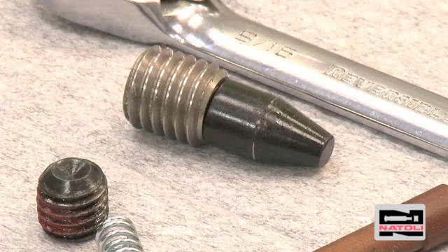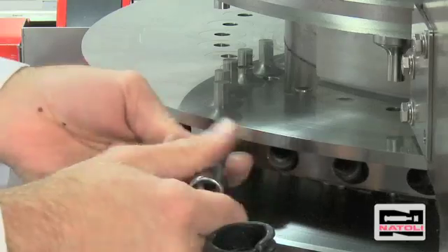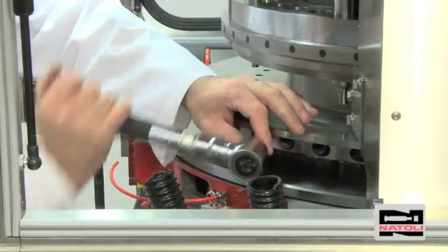Take the die lock screw and insert it into the die lock hole. Screw it in until it comes in contact with the die. First hand tighten, and then two clicks of the torque wrench are all that's needed to secure the screw.